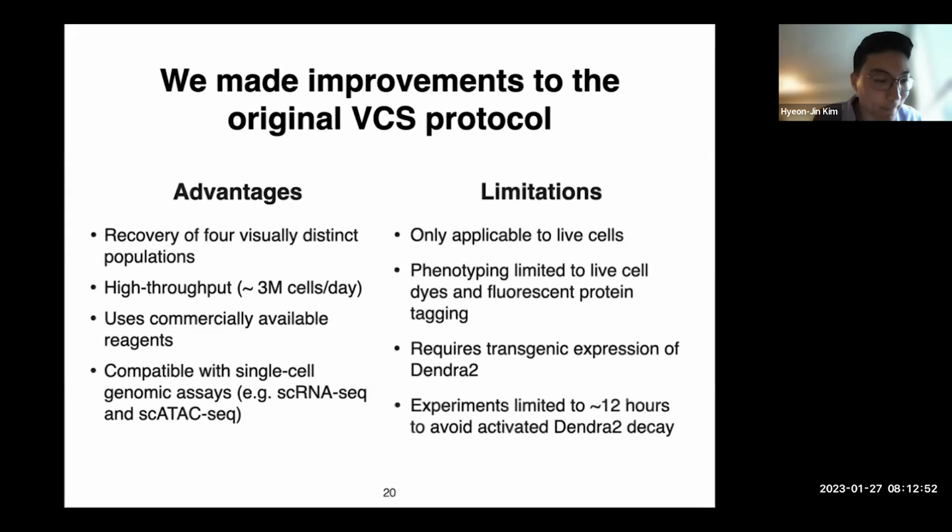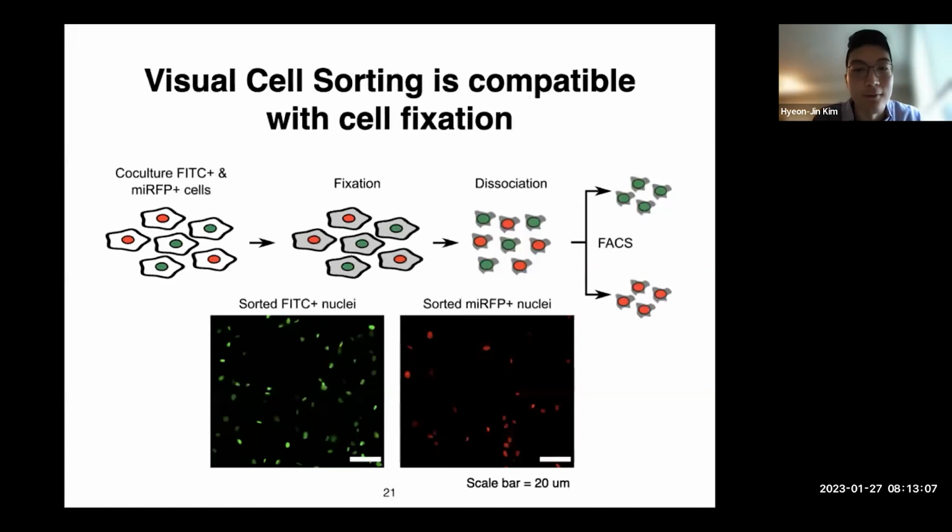So what we did in the past year or so is we've been optimizing and improving the protocol by making it compatible with cell fixation. So I'm just going to show you some of the results that we got and convince you that we can do this with fixed cells.